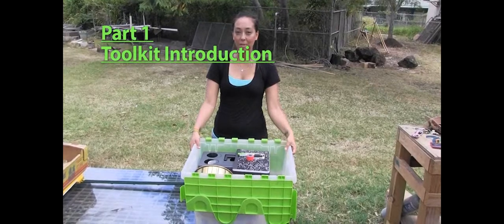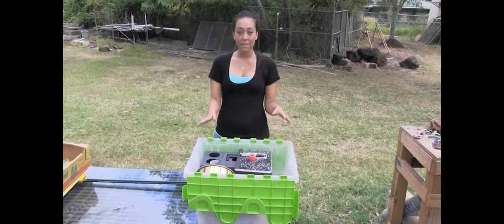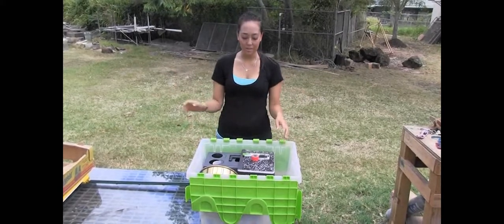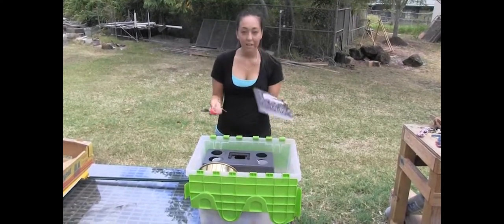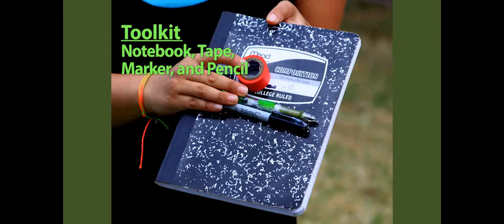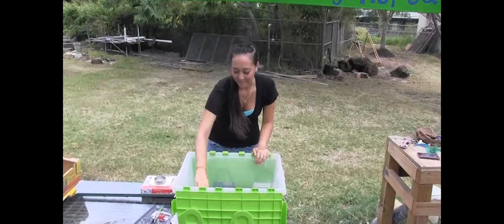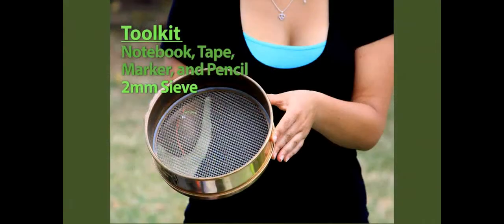First I'll go over the pieces of the kit and then I'll show you how it's used. So first in your kit you always have your notebook, extra tape, a Sharpie, and a pencil just in case. This here is our big two millimeter sieve that we're going to sieve our soil that we take out of the ground from our field.